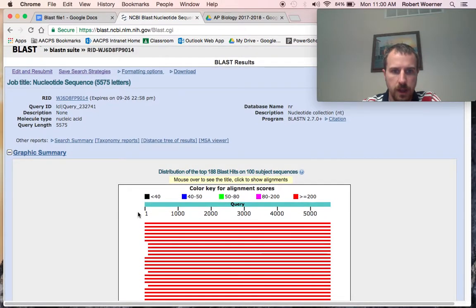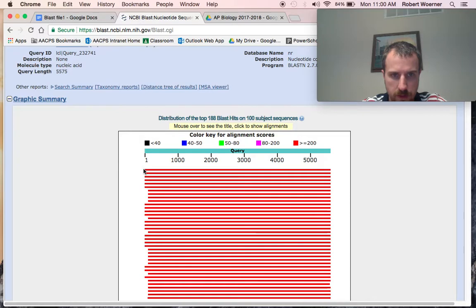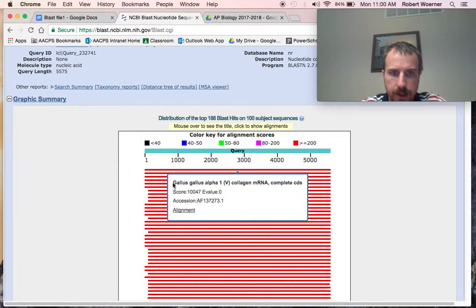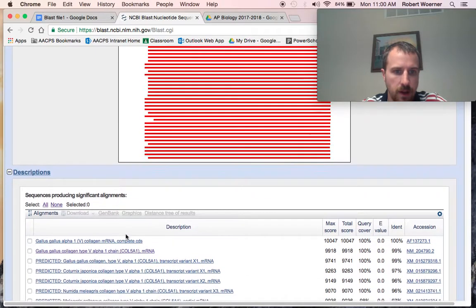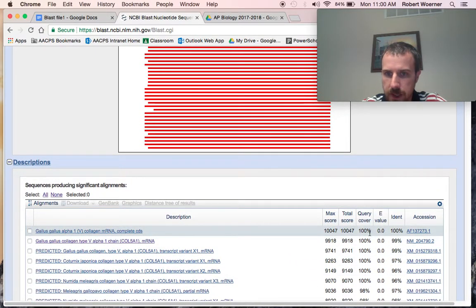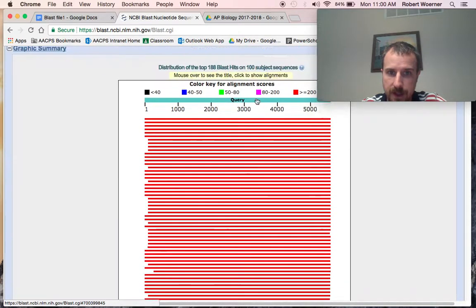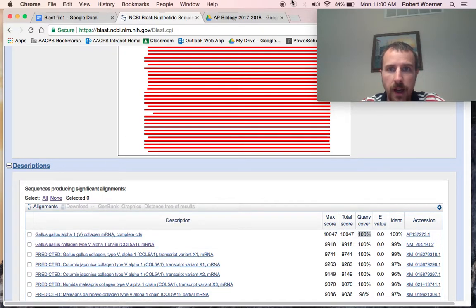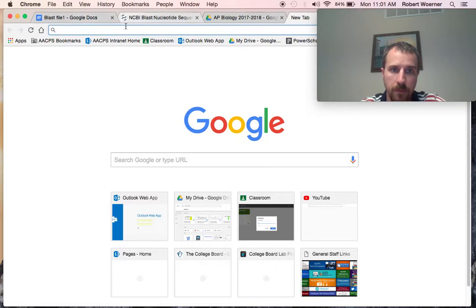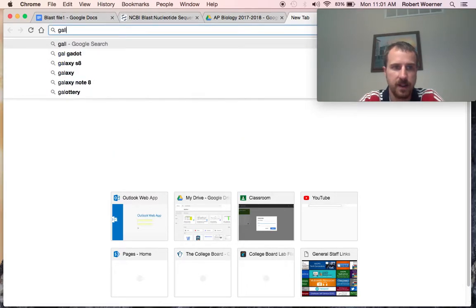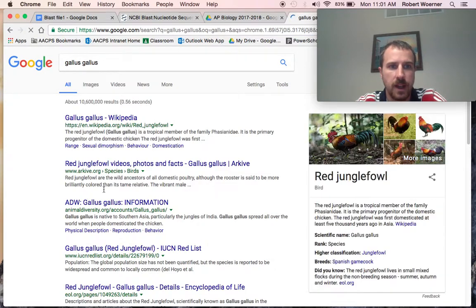Here is our query. That's what we put in. It's got about 5500 DNA bases. And so, this first line right here, if we click on it, it's going to say Gallus gallus Alpha. I don't know what that means, but what we can do is we look down here and we see that it's got 100% cover value. That means this is the same gene as this Gallus gallus. To look that up, what I would suggest doing is going into Google and typing Gallus gallus and finding what pops up.